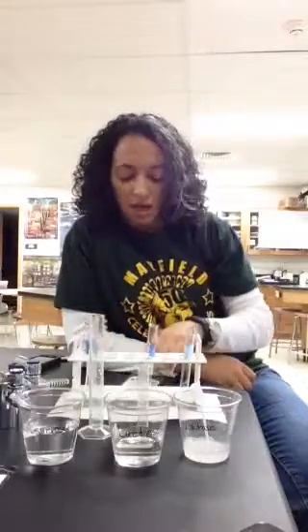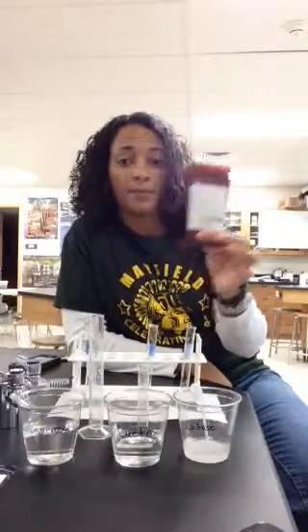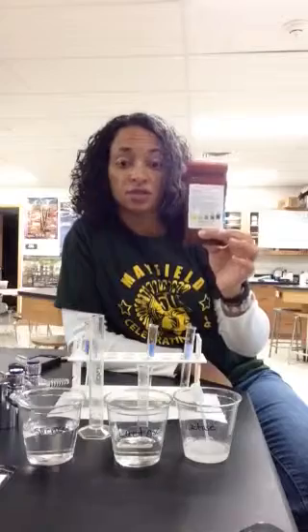Now we're going to be testing the action of the enzyme lactase on these 2 disaccharides by testing for the presence of glucose. So lactose is made up of 2 monosaccharides, glucose and galactose. Sucrose is made up of glucose and fructose. So if lactase is able to break these 2 disaccharides down, glucose will be present and it will show up positive on one of my glucose test strips.